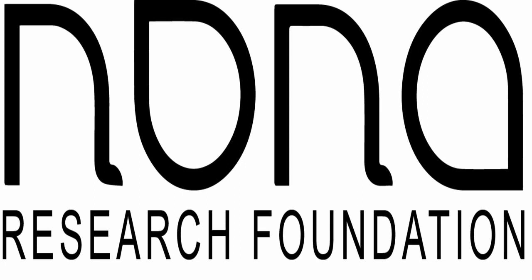And the first thought is, do we have any really tractable or easily maintainable solutions? I think starting off with making a standard around these LIMS software is going to be easy. And I can take that as part of the Nona Research Foundation to start to say what a data schema should at least have in basis.